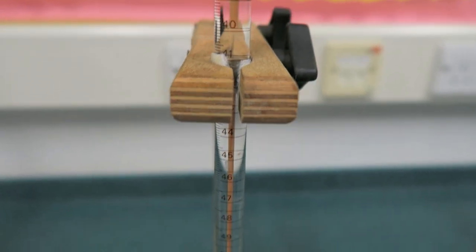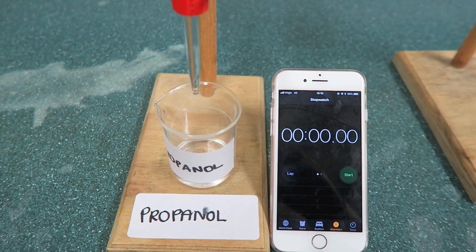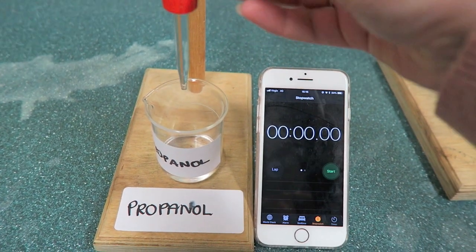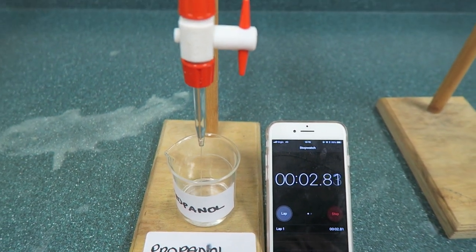A second burette was filled to the 35 line but this time with propanol. The same experiment was repeated. The burette was opened and allowed to empty until the 50 line and was timed as to how long this took.